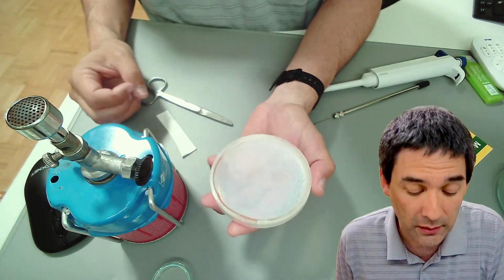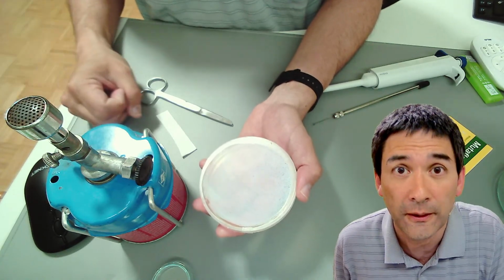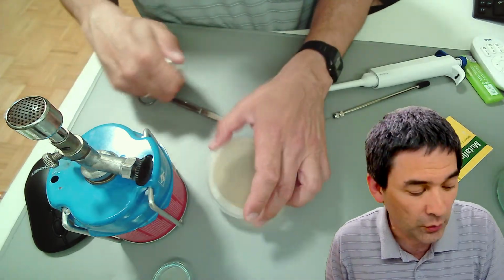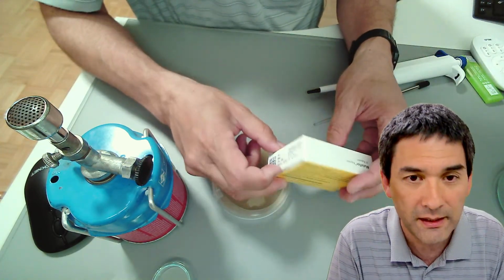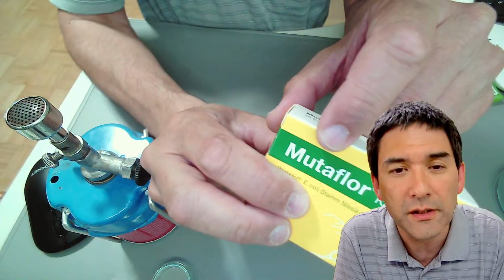If you want to work with bacteria, like in this demonstration, you want bacteria that are extremely safe. So you need a safe source of bacteria, and I'm going to show you one, and you'll be surprised where I bought them. We got them from the drugstore. They're capsules, medicine. These are actually E. coli bacteria. I don't know if you're able to read this here. It says here E. coli.